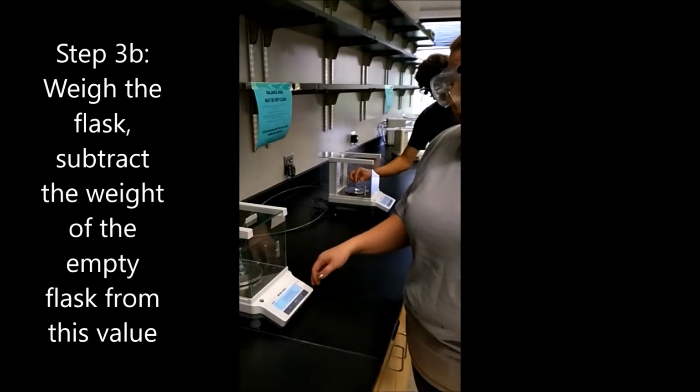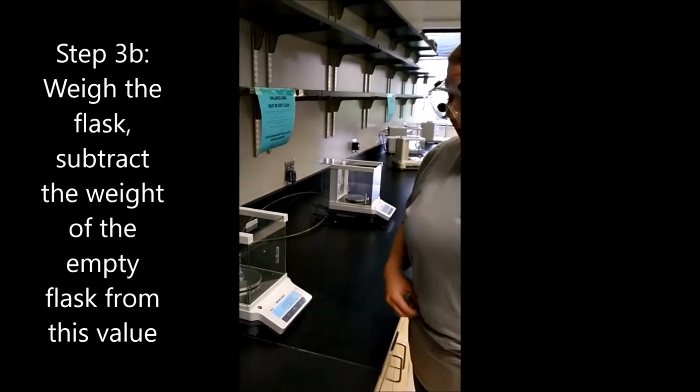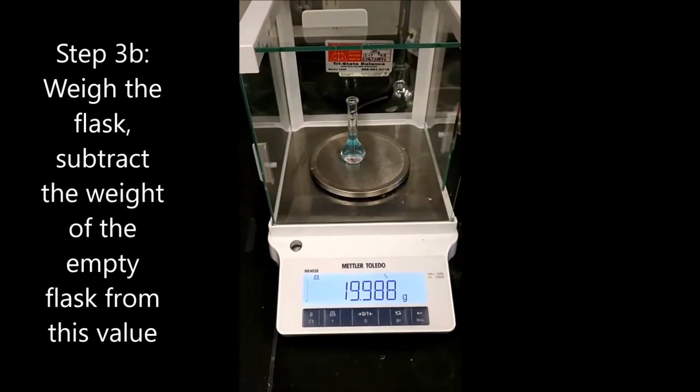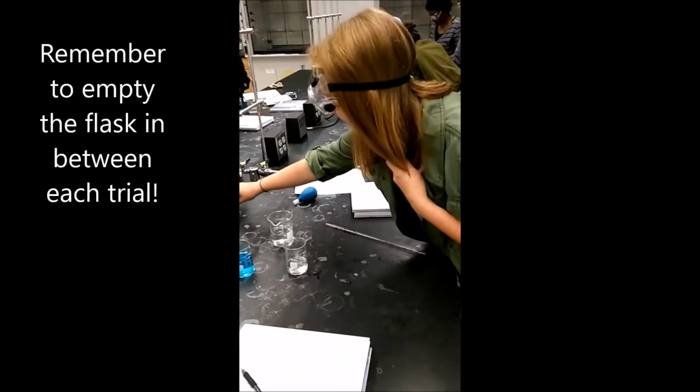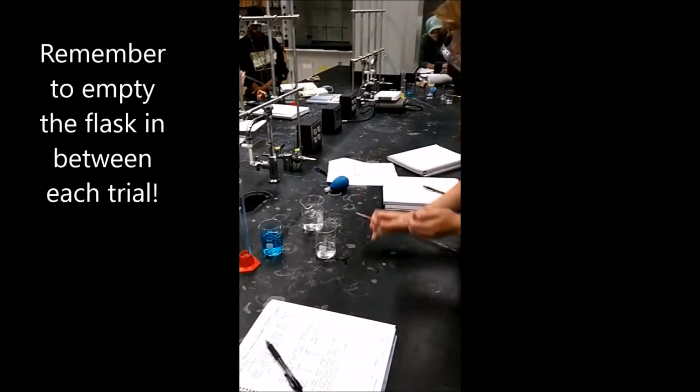Measuring the 8 milliliters of sugar solution and then 2 milliliters of water, it's measured at 19.989 grams. Rinse in between each solution change.